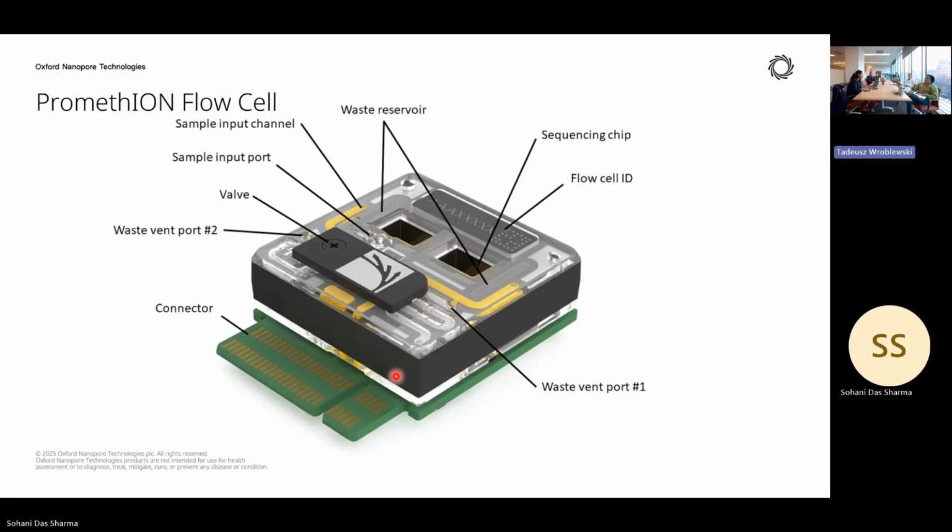It depends. For cfDNA, the protocol I described is very specific for gDNA sequencing. I'll show you what our recommendation is for cfDNA. But I also want to mention that all the benchmarking data we have is from plasma cfDNA. We do not have any internal documentation which can support CSF cfDNA.